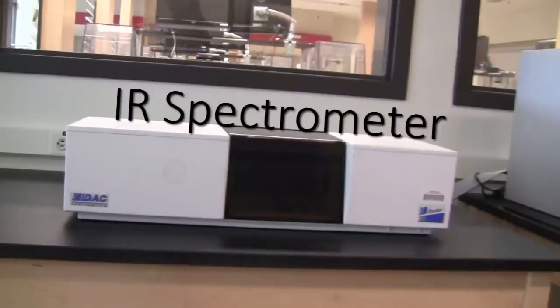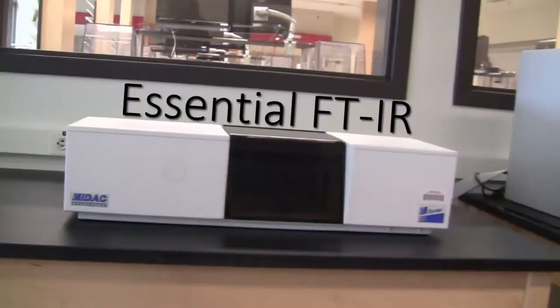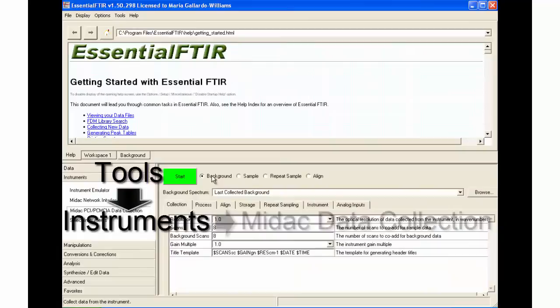There's an icon on the desktop so you can start it from there. After you open the software, you will select Tools, then Instruments, then MIDAC Data Collection. This will take you to an interactive screen.